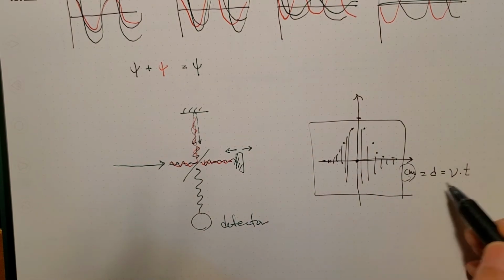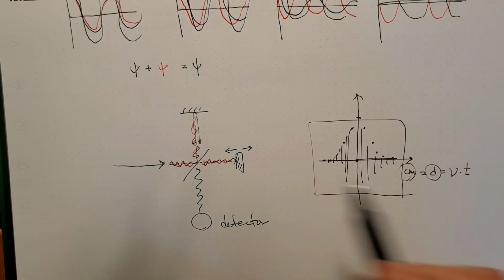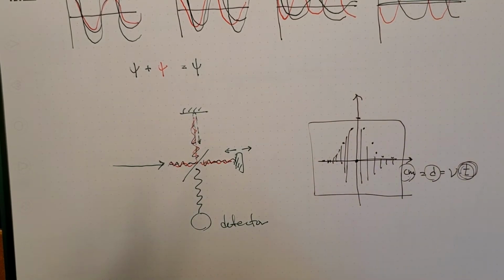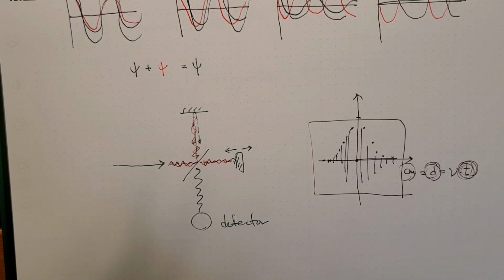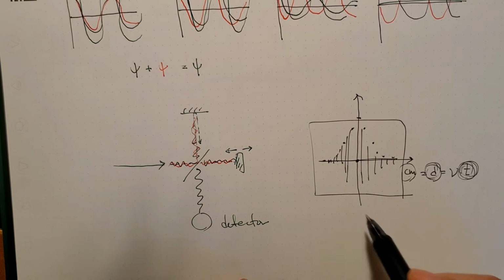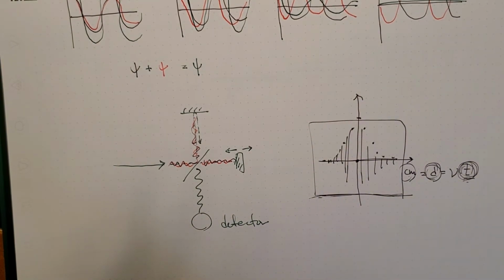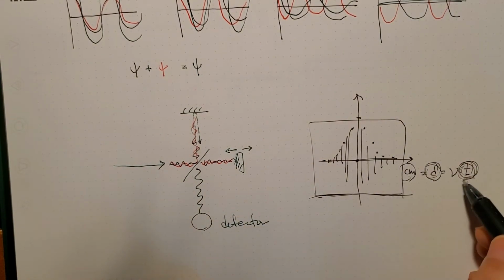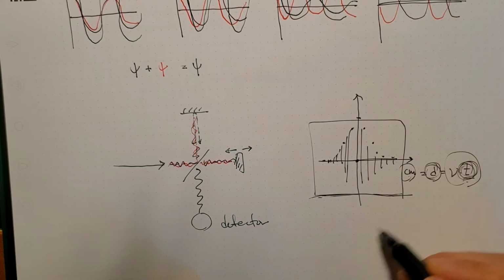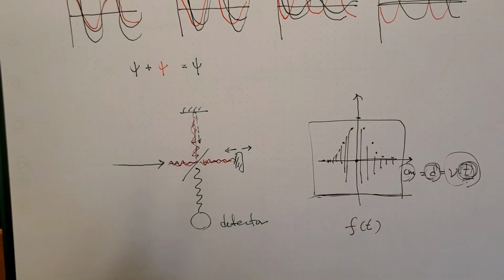So you can consider the same velocity of the moving mirror. Time domain is almost the same as the distance domain. So you have a wave function in time domain. That's the wave you get as an interferogram. So this interferogram is the time domain function you got.